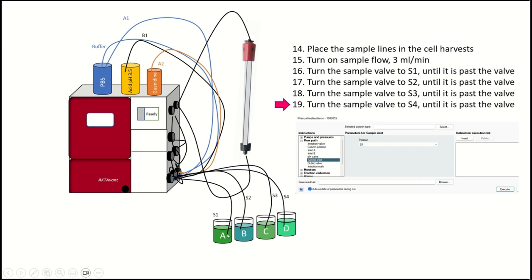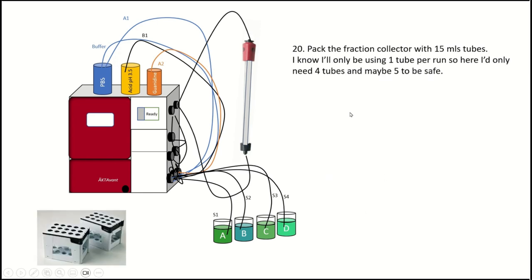So what I like to do when I'm putting these things in here is I like to kind of flick it a little bit, the tube a little bit with my finger, just before I put it into the sample pump. So I get a tiny little air bubble right there. And that gives me a good indication of when the solution is all the way into the sample valve. And once it's in there, it's pretty much good to go. You're probably going to wash this out with buffer a little bit at the end. And all the lines are going to be full of your sample. And almost none of the sample's going to go past the valve doing that.